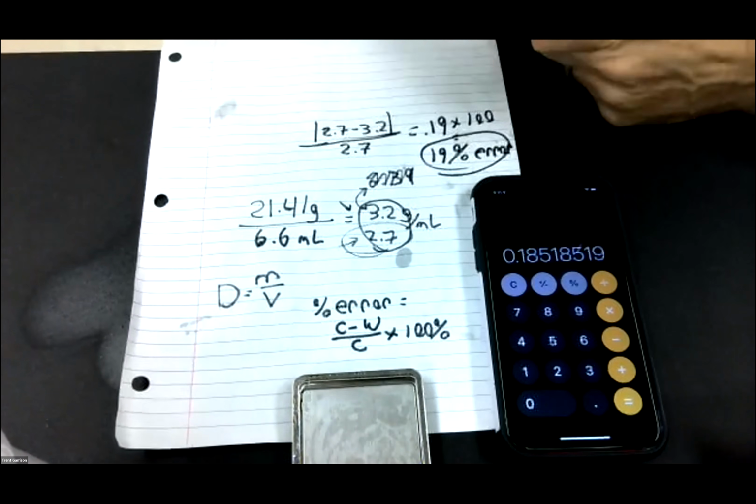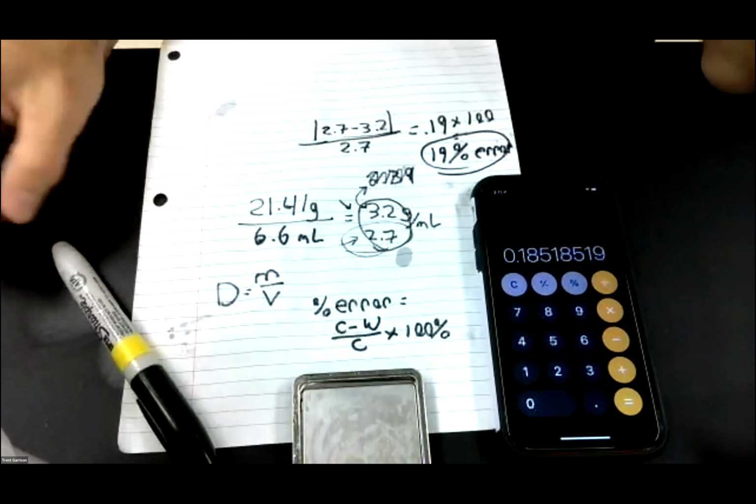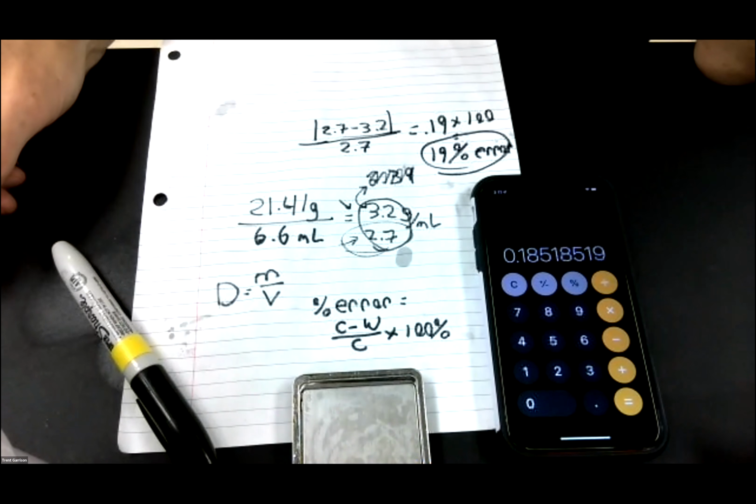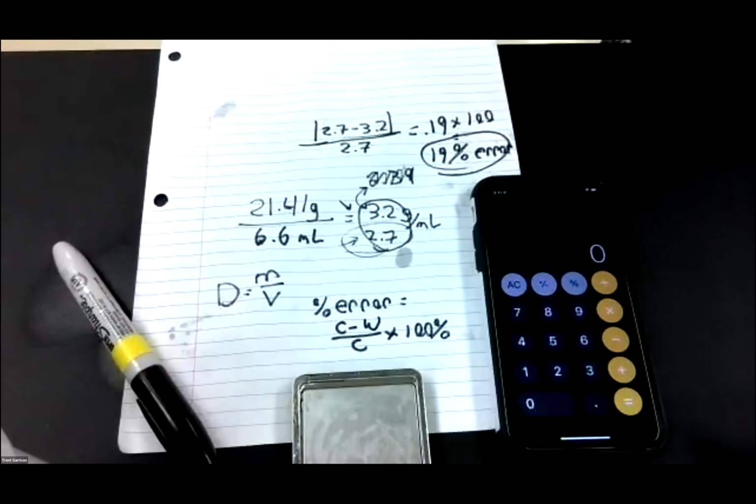All right, this is the kind of work that you are going to have to do on your own, okay? So hopefully you followed along with me as for how to make these calculations. Awesome. This is everything that I am wishing to share with you today. This is our density lab, and hopefully you've learned a little bit about significant figures, density, and how to make those calculations.